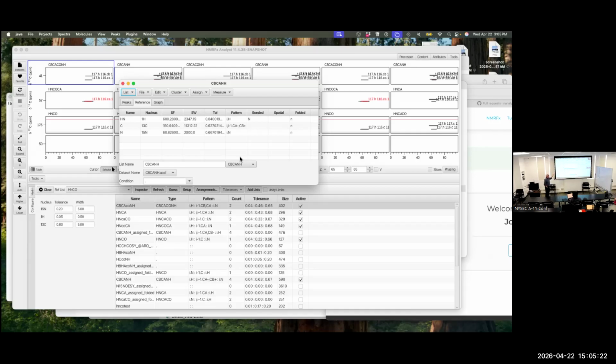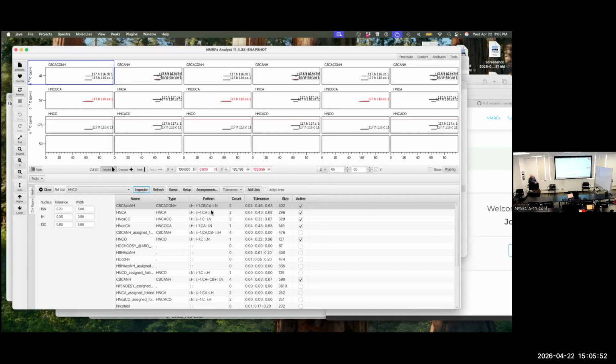Remember the minus here in the peaks, because some were negative. The minus after the CA means that the CA peaks in this experiment are going to be negative and the plus means they are positive. So if you want to automatically type them, it can look at the sign. That took a while to figure out, because the other day it wasn't working right. Then we realized most people collect it the other way, CB negative and CA positive. This data set, for whatever reason, was inverted, so we had to change from our default pattern. Okay, so that's the pattern.